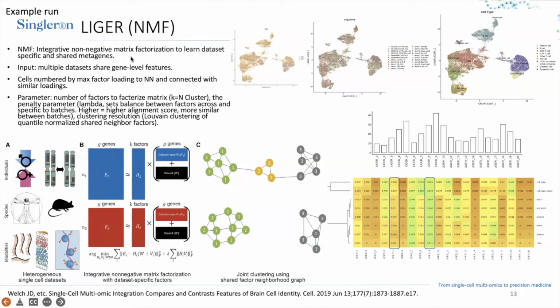So this is one benefit of using NMF compared to the normal PCA calculations.